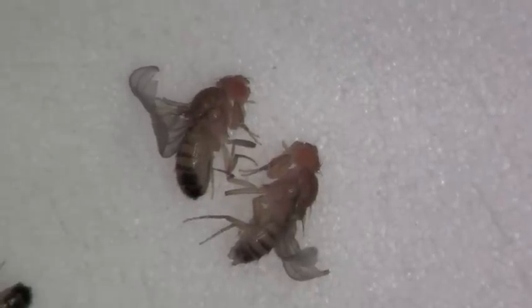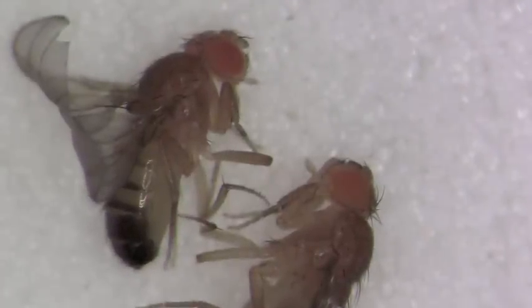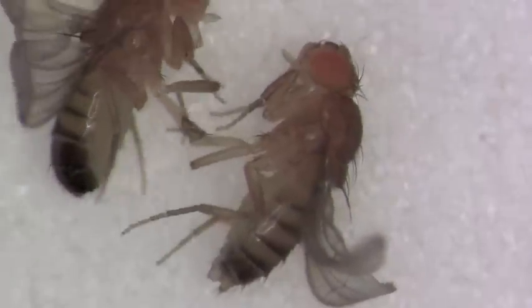Here's now a male and a female together. The pigmentation differences in the posterior end of the abdomen are more clear. You might also notice the sex combs on the first leg of the male — the anterior-most leg — and the absence of that in the female.